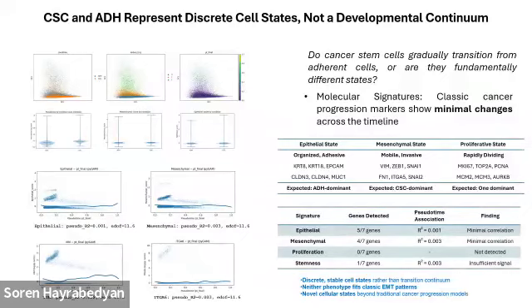And the last thing I want to show you is a little bit more tricky to use and interpret. This is a kind of trajectory analysis. There are a couple of ways to do trajectory analysis, but the whole idea behind it is that you want to see if, from one state to another state, there is a set of genes that will guide you from one state to the other, and you align those patterns between these cells on a pseudo timeline.